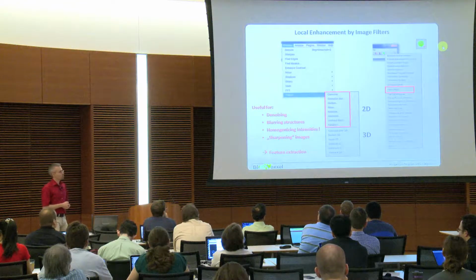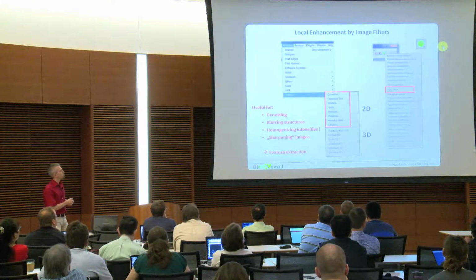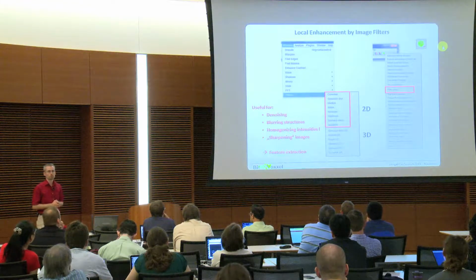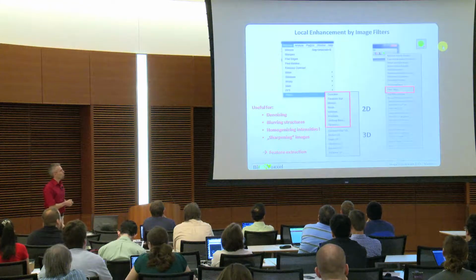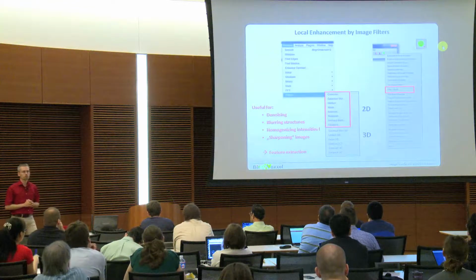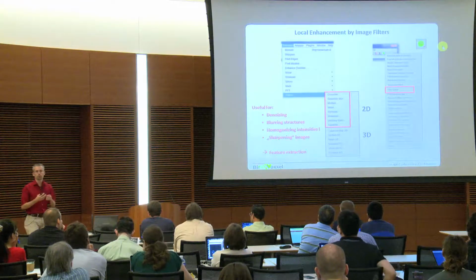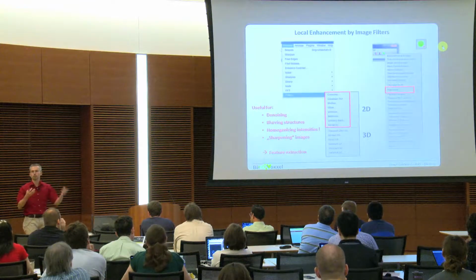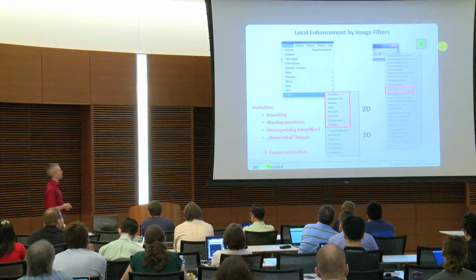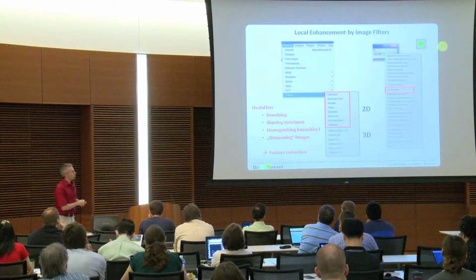In general, we use them normally to either denoise the image or blur structures. You have seen one example where we can use the Gaussian blur to blur some structures. Or homogenize intensities. This is something which later on will become very important, because whatever looks more homogeneous is clearly visible for a human eye. This belongs together, and then also for a computer it's easier to decide, okay, these pixels belong together and should be extracted together. We can also use them to sharpen images.